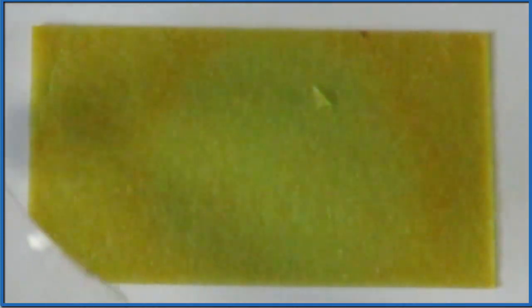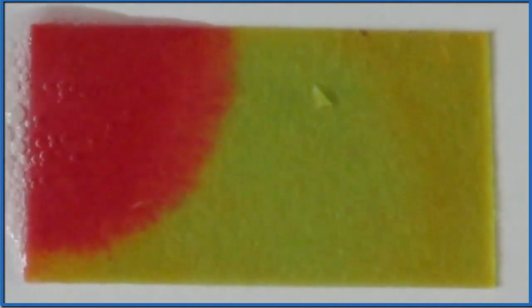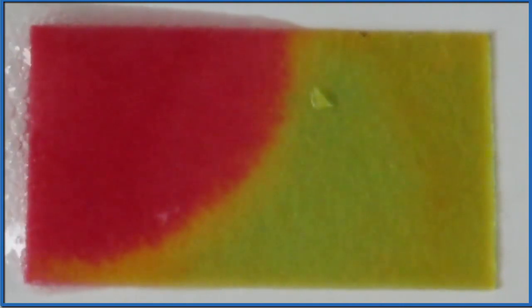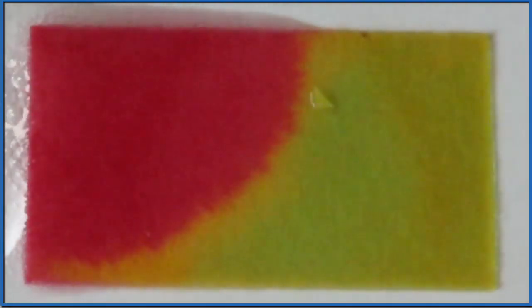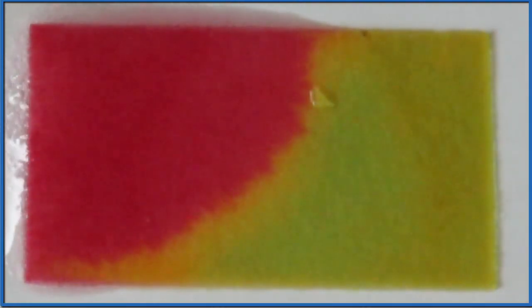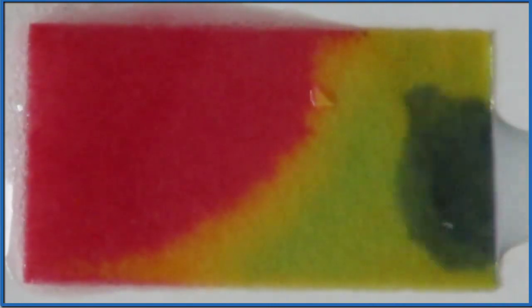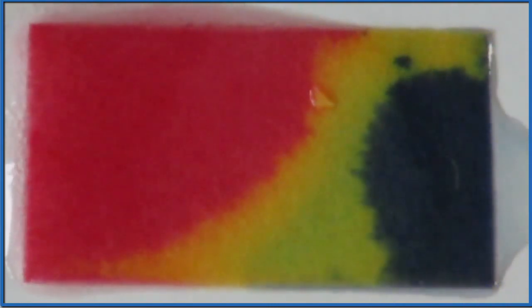But then we're going to put pH of 0. This is a one molar solution of hydrochloric acid. You see that red there. Next, we'll put a pH of 14, a solution with a pH of 14 on it. That's sodium hydroxide, a one molar solution.